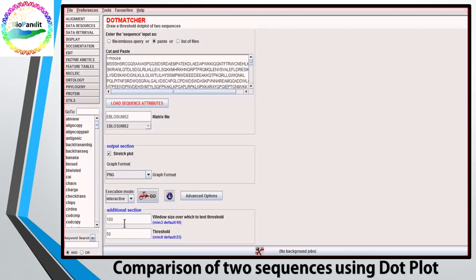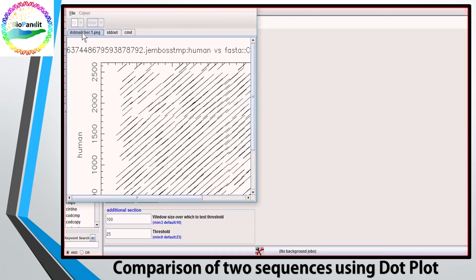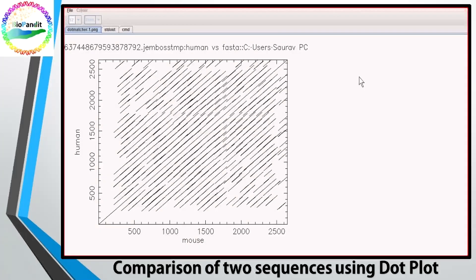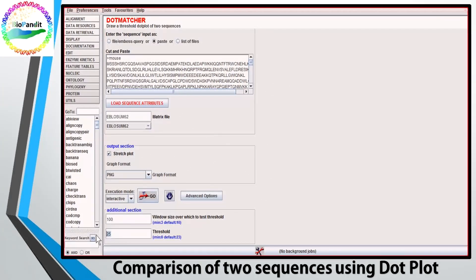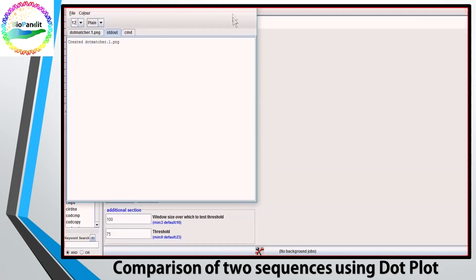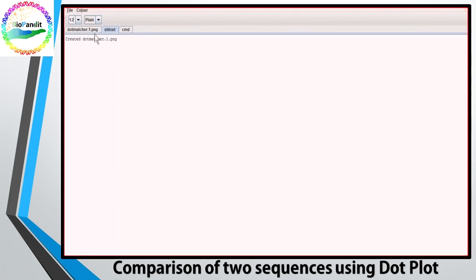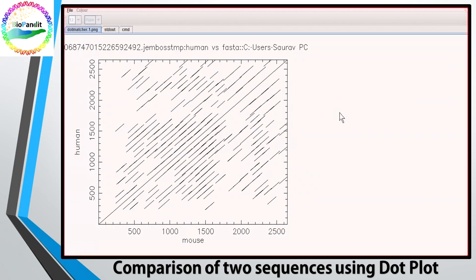Now let us reduce the identity threshold to 25%. You can see the lines are too many. Obviously, at lower identity threshold, you would always get more noisy off-diagonal lines. If you just elevate the identity threshold to 75%, this noise reduces.